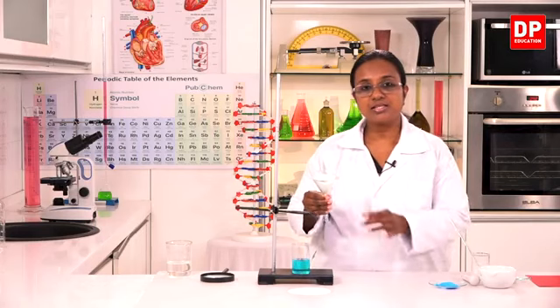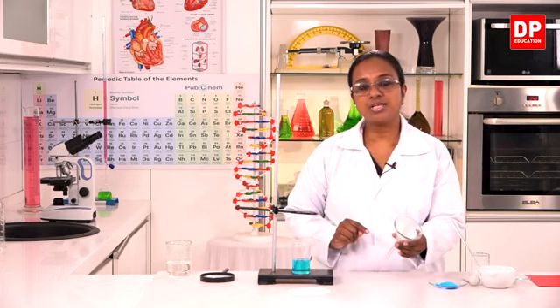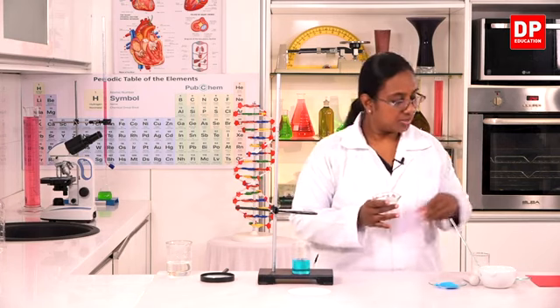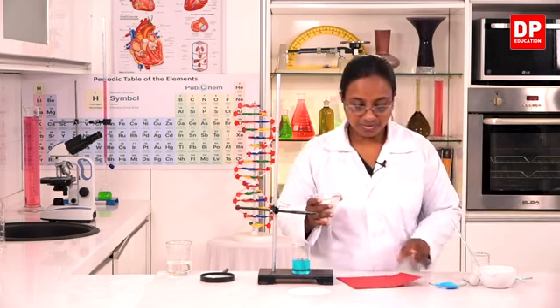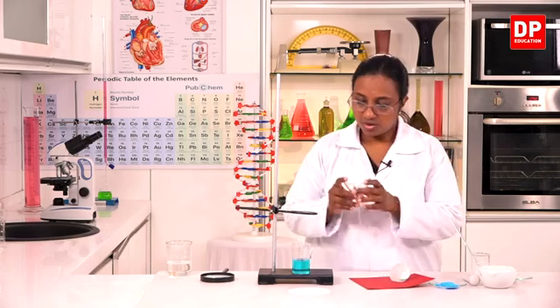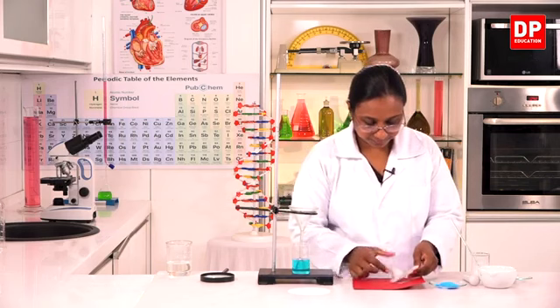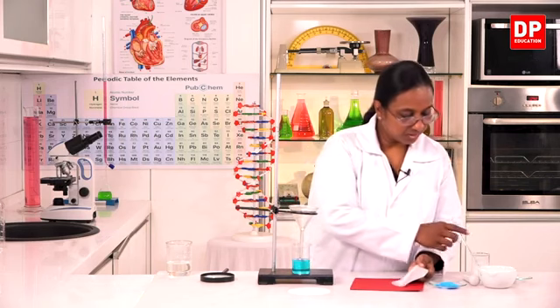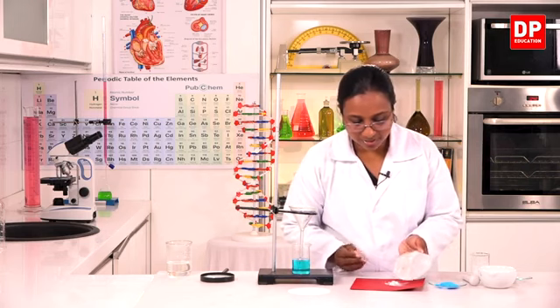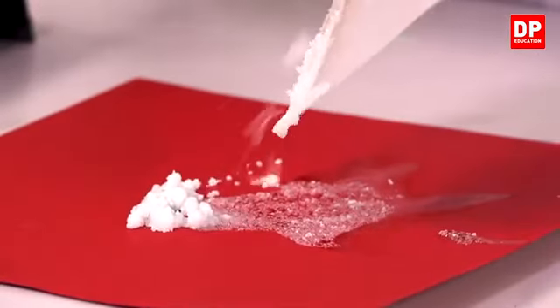And this process where we filter this, it's known as the filtration process, and you all know it's a physical separation method. So if I transfer the solid substance that is there inside the filter paper onto this colored cardboard, we will have to really dry it and observe. For now, I will show you all that this is a white color solid substance.